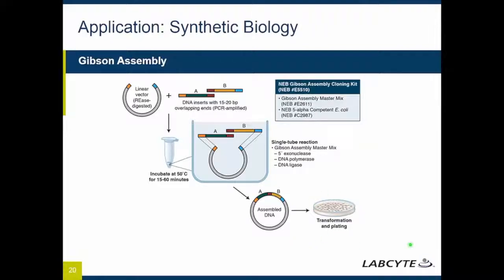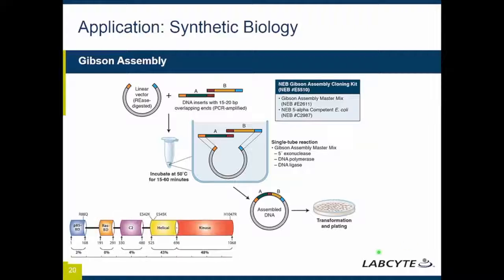Now, as a side note, one of our current projects is to apply this technique to generate various PIK3CA mutations. This will be accomplished by stitching together engineered oligos for the helical domain and really stepping through to identify and recreate different mutational states within the isoform. Stay tuned for those results.